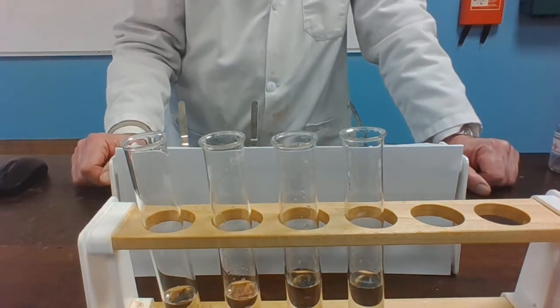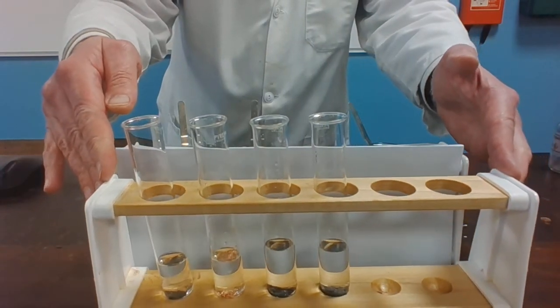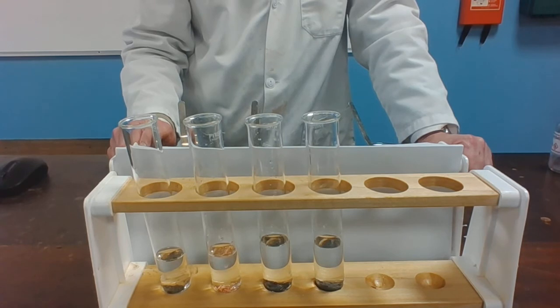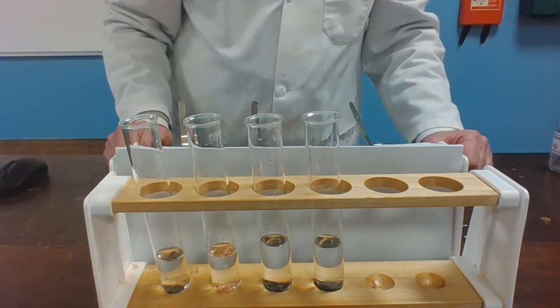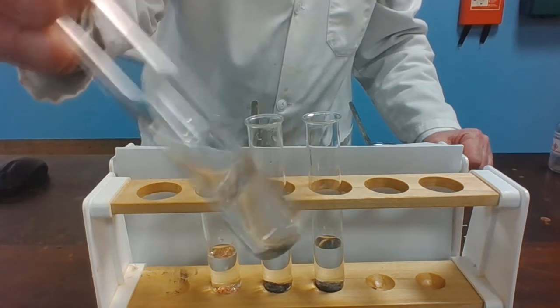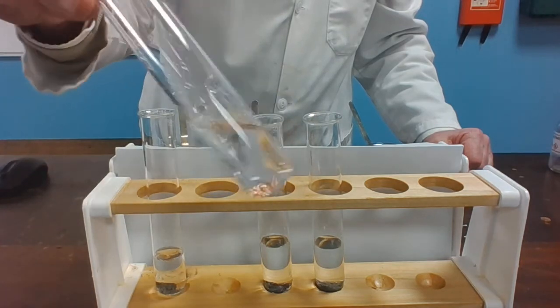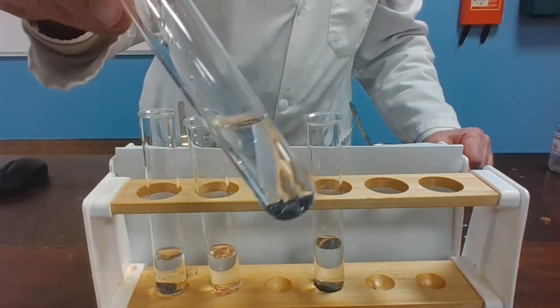Again, just leave it for a few minutes and I'll show the tubes again. I want you to write down what you can see — if there's been a displacement reaction or not. So that's with the iron filings — is there any evidence of lead being formed there? Copper turnings. Zinc granules. And the magnesium turnings.